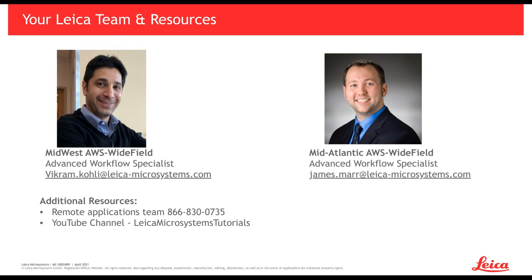Hi. Yeah, thank you for these questions. We've got a few of them here in the chat, and I've tried to respond to some directly via the response, so hopefully you're getting those.